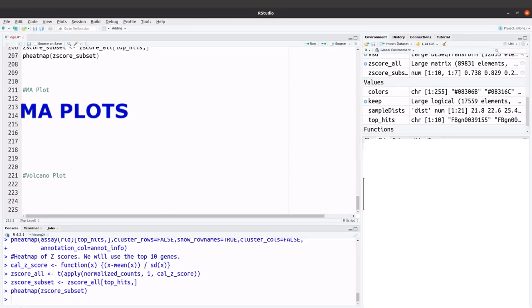We are now going to generate our MA plots. MA plots are plots of mean expression versus log2 fold change. The mean expression values are on the x-axis and the log2 fold change values are on the y-axis. MA plots are useful for visualizing the distribution of gene expressions.